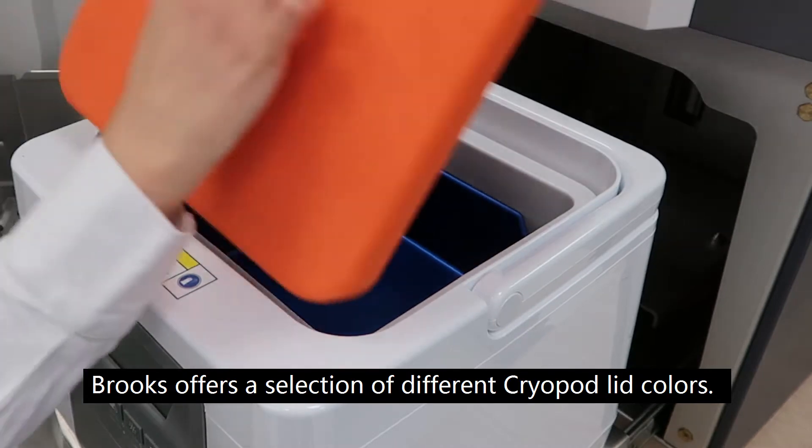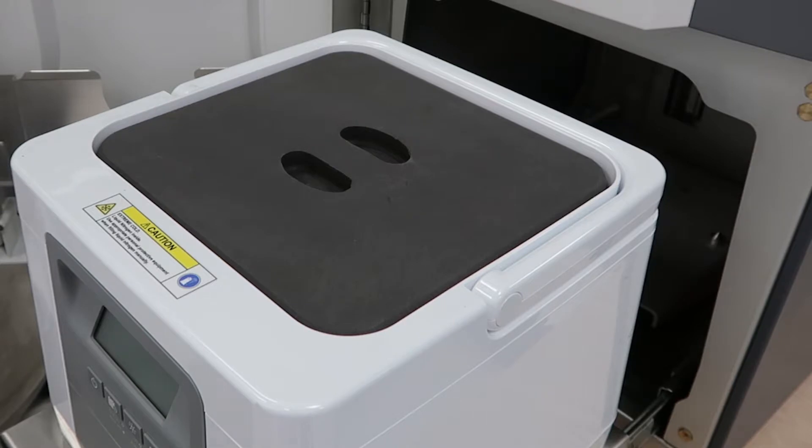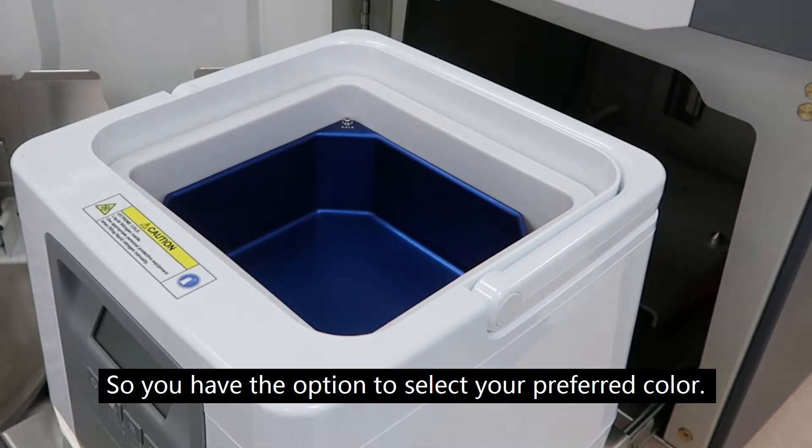Brooks offers a selection of different cryopod lid colors: orange, green, gray, pink, and purple. So you have the option to select your preferred color.